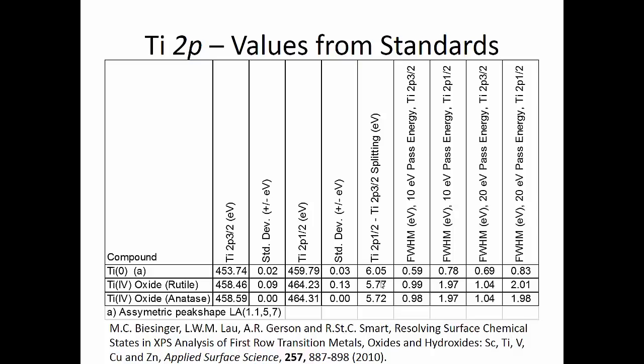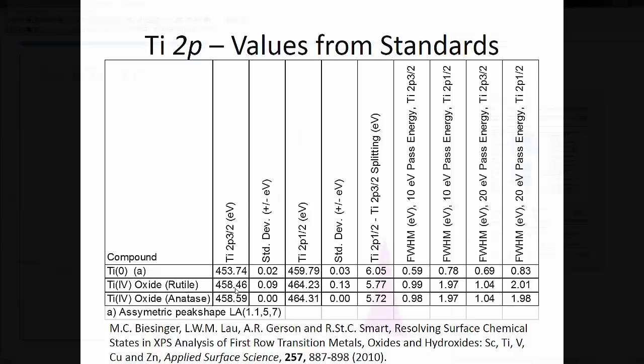It actually varies for the different materials, so you can see in the oxide and the two different oxides we have 5.77 and 5.72, so we'll have to take those sort of things into account as well. We can also look at where the peak position is going to be - it's around 453.7 eV, and we'll put that into our fitting routine as well.